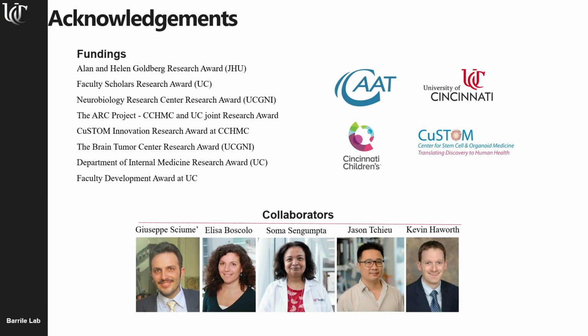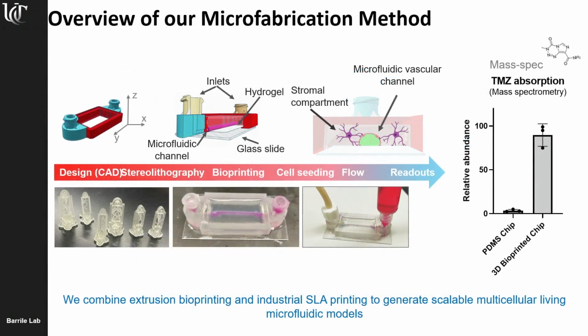We still adopt an organ-on-chip approach. Sometimes you start with one cell type and then add others. For instance, we can print a gelatin hyaluronic acid hydrogel that already has cells in it. But you may want to see the endothelial cells at a later time point, so we print the hydrogel with cells, and then add endothelial cells to the microfluidic channel at a second time point.